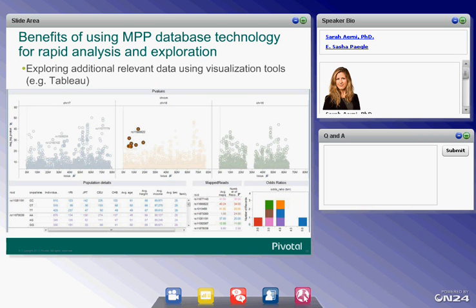You can, in fact, highlight a few of those SNPs, and what we did was take a publicly available genome that had been sequenced and allow us to point and essentially look at all of the reads that map to or contain that particular SNP. And here we've just posted the average map quality and the counts of the number of reads that contain that particular SNP. So again, by using this MPP technology, these types of searches are enabled and made very rapid.